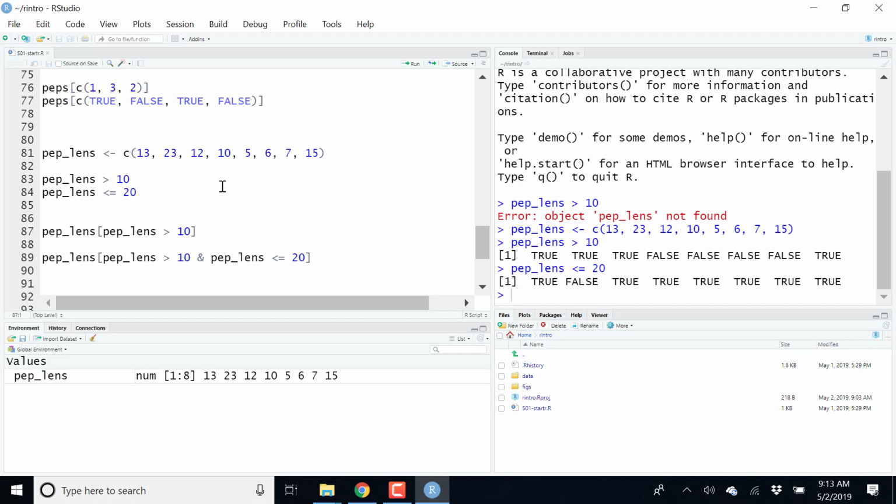Under the hood, if we look at the code, there is code behind the square bracket operator, count behind the greater-than arrows, all those signs. And of course, if we look into the implementation of these, there are conditions and if-else. But here, this syntax is meant to be used interactively to explore data.